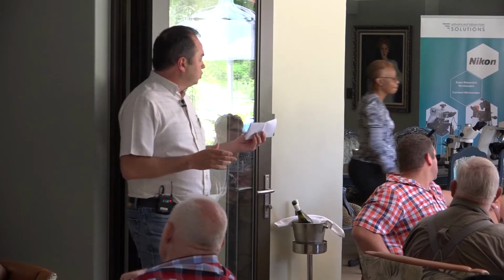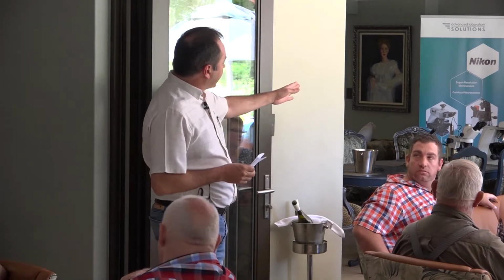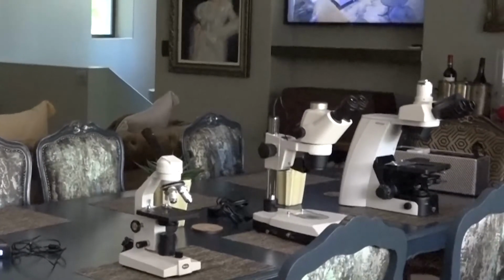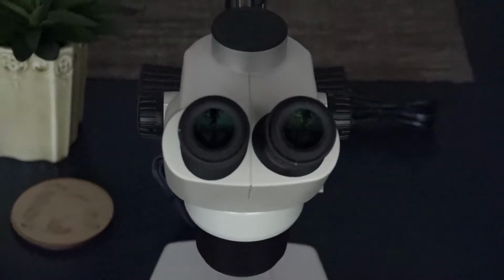So optical microscopes can really be broken down into 2 categories. What you call a stereoscopic microscope and a compound microscope. And the one that is most commonly used in your applications is the compound microscope. So the 3 microscopes that I have here, the ones on the end, the left and the right side, are your classic compound microscopes. And the one in the middle is a stereoscopic microscope.